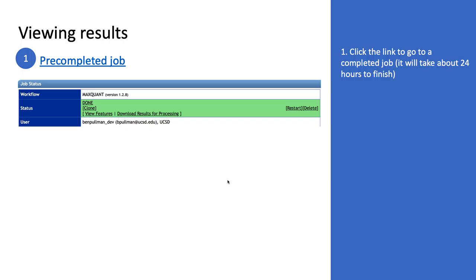So a couple of points before moving forward to the next steps. Notice what just happened here. You're looking at the search results from someone else. In this particular case, we ran it with the purpose of sharing for this training activity. But you can also do that yourself. If you want to share your results with a collaborator or someone else in the lab, you just take the link from that page and share it, and then others can also access it and look at it. Now, the chances that anyone is going to guess one of your links and do something with it is ridiculously low. If you look at the size of that random string in there, it's just not going to happen. If it does happen, they almost deserve a prize.